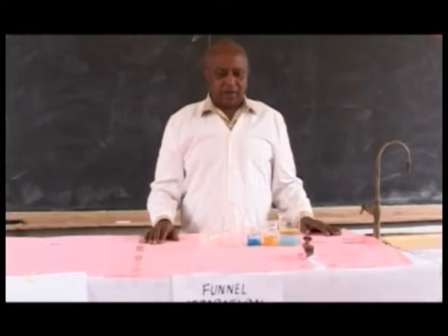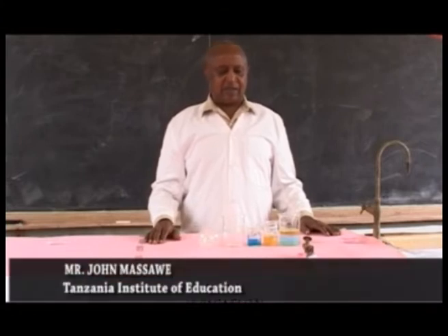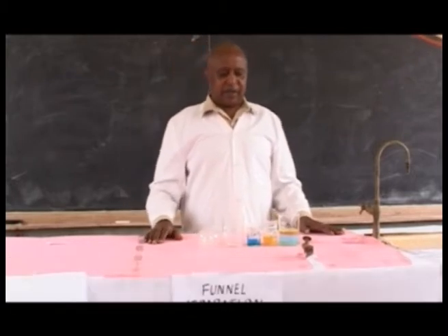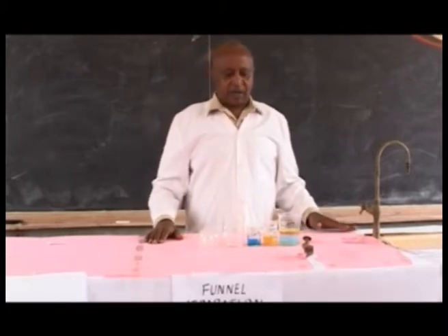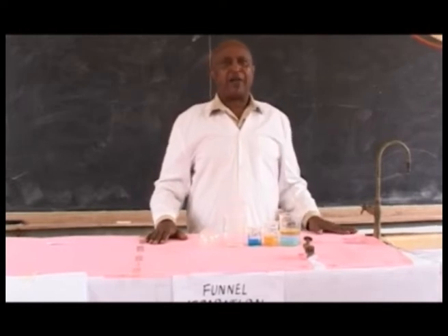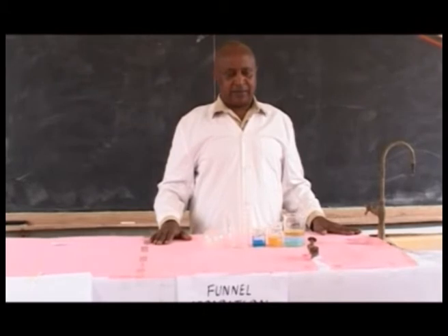Another method of separating mixtures is funnel separation. The aim of this experiment is to separate a mixture of two liquids which have different densities.